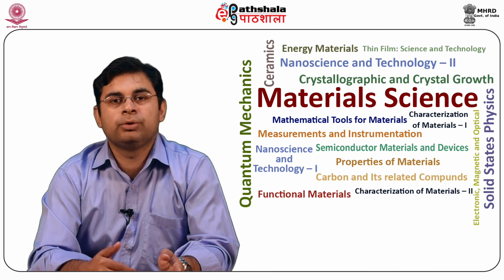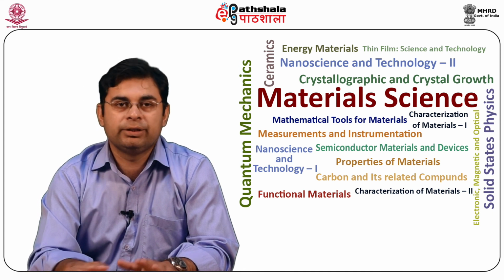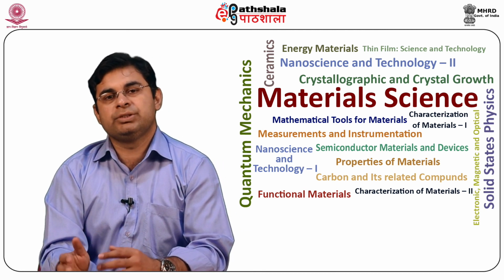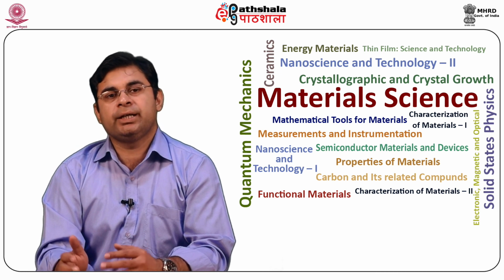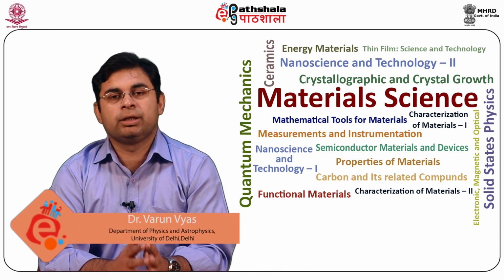So students, let us summarize what we have learned in this module. In this module, we studied two kinds of scanning probe imaging techniques. First, we studied scanning tunneling microscopy, where we briefly discussed the phenomenon of tunneling.